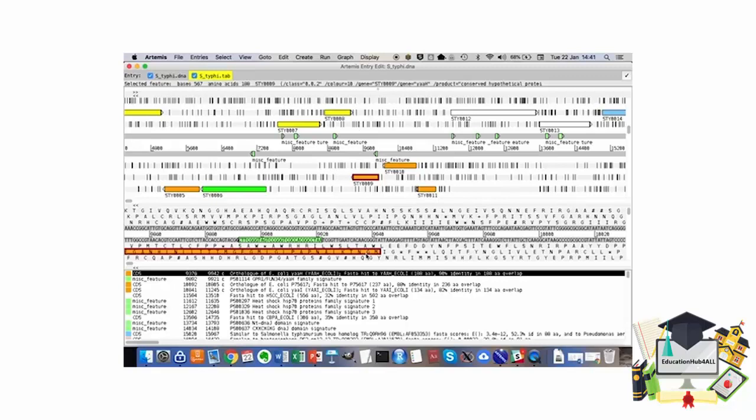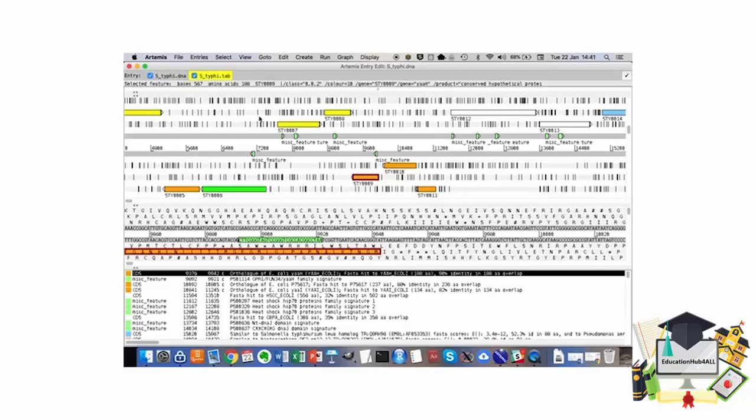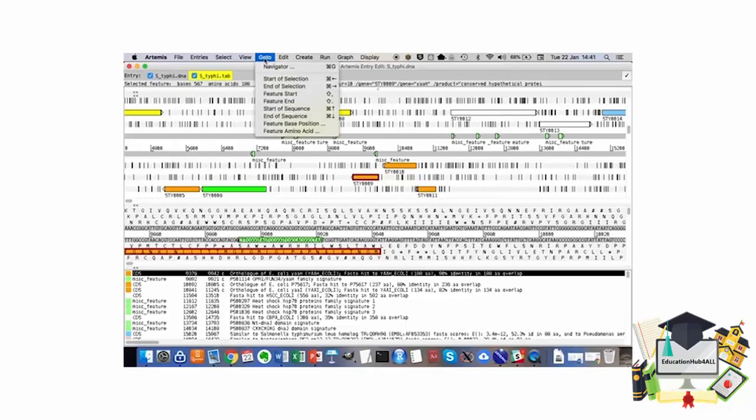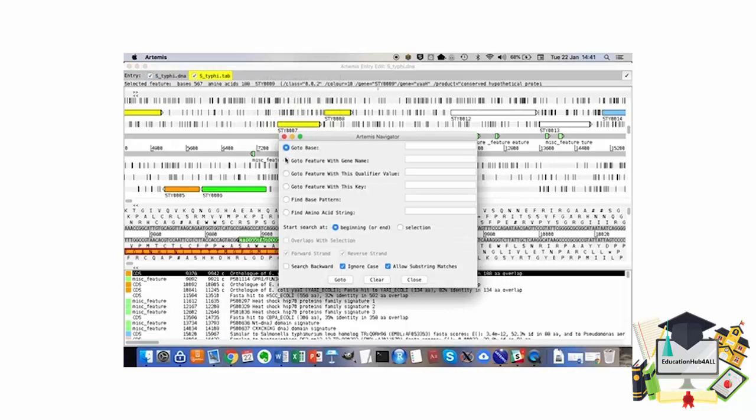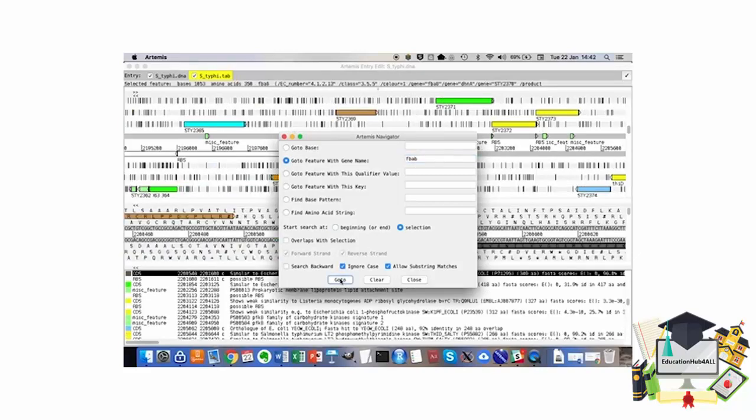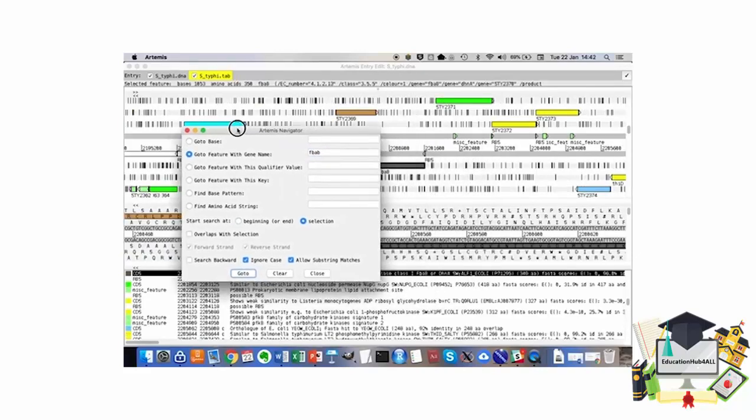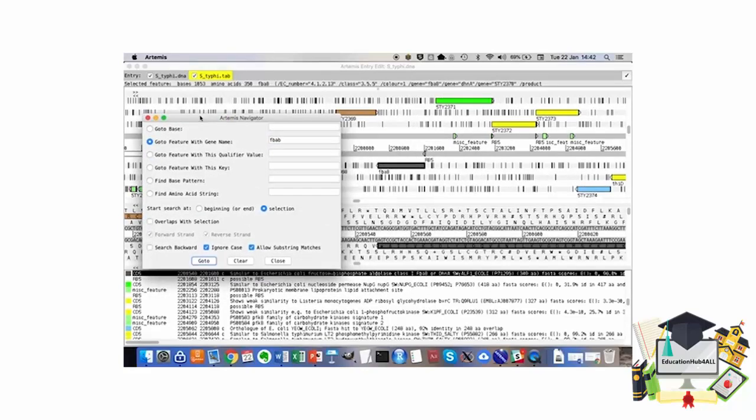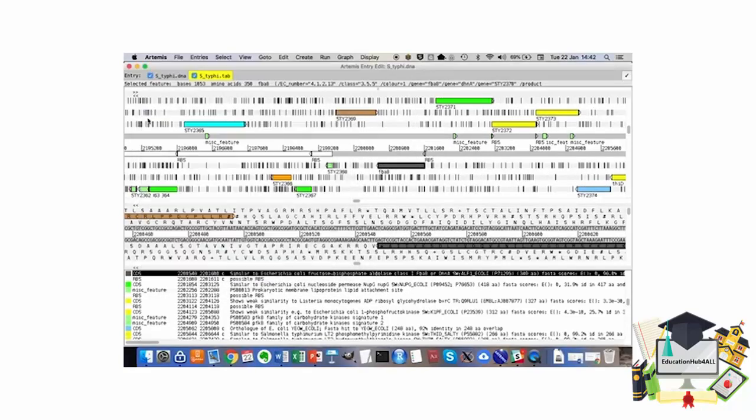Our next task is to navigate to one of the genes called FBAB. In order to do this, I am going to use the navigation window, go to Navigator, and go to Feature with Gene Name FBAB. We can't see it here, but if I move the window, that's the gene over there. I'm going to close this. So this is the FBAB gene.